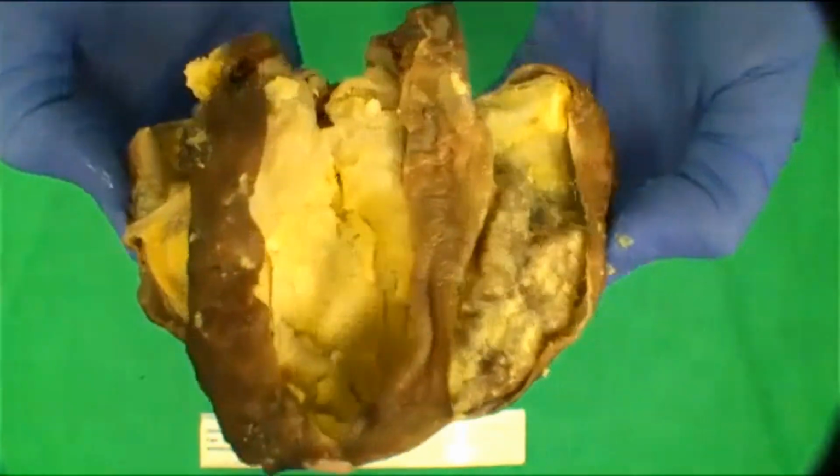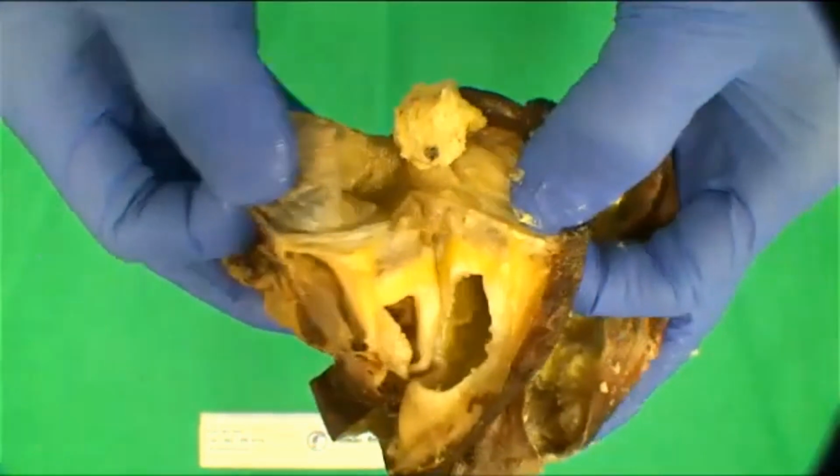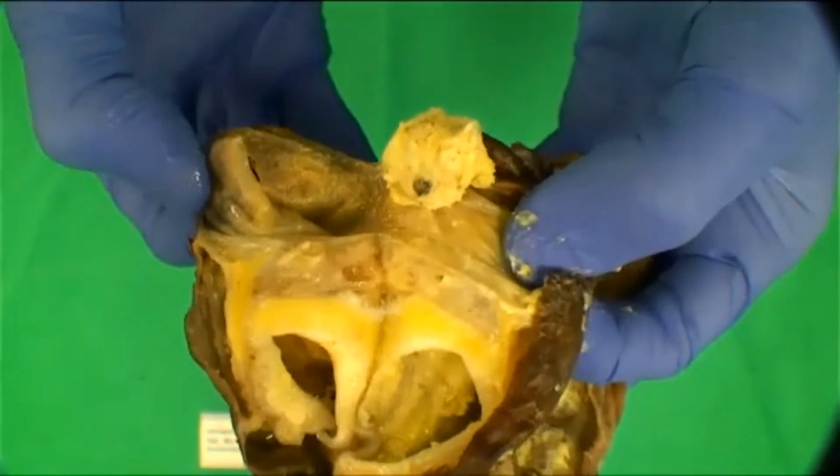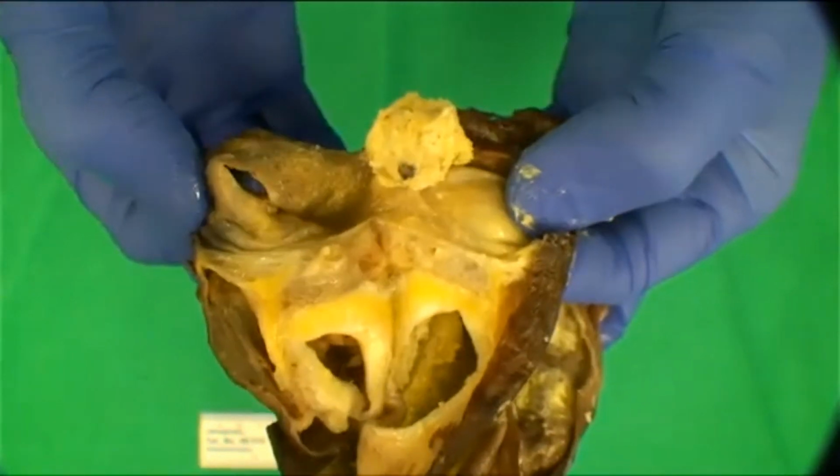Do you decalcify them? No, we wouldn't generally submit the calcified components because we know that they're within the normal range of what these cysts do, but we wouldn't submit them for decalcification.